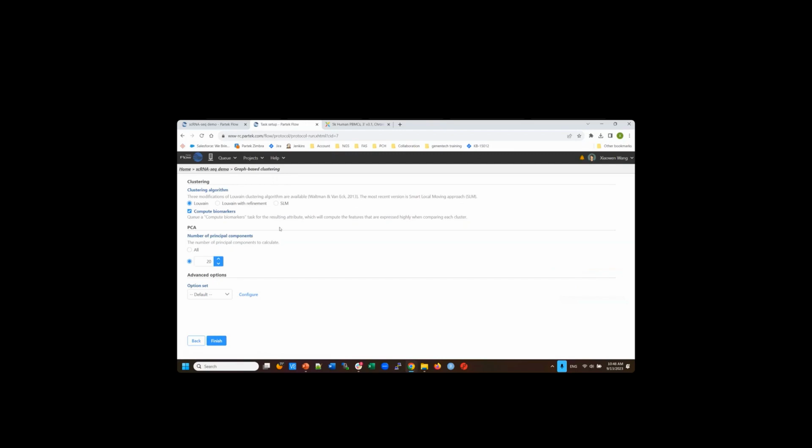However, you can change settings. There's advanced; every time you see an advanced option, that means there's more tuning for this. If you don't know what to do, the default is not too bad an option, but it won't be the best option for your data. That's why you have to try it. I would recommend you pay attention to the resolution parameter. Of course, other parameters will also affect your result, but for this one, if you mouse over here, it will tell you, if you increase this number, you will have more clusters. Decrease this number, you will have fewer clusters.